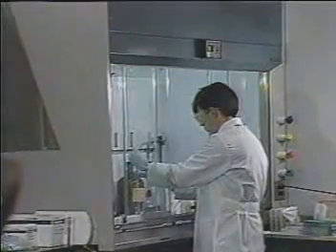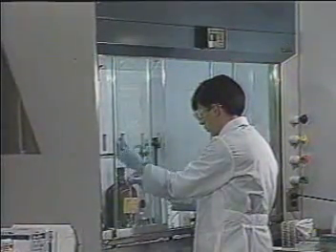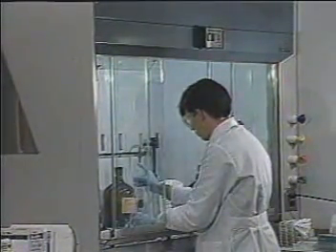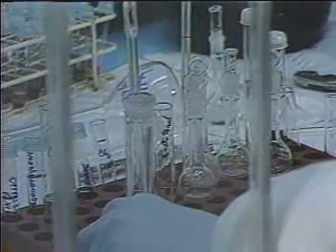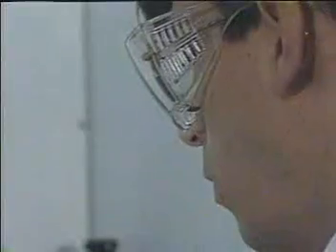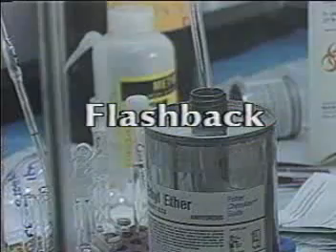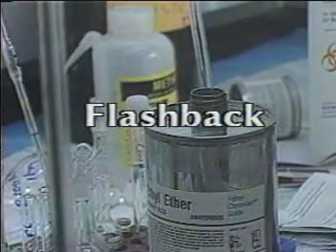Adequate ventilation must be provided to keep chemical vapor in the air from reaching lower flammable limits. Minimize all releases of vapor. Auxiliary ventilation is required when using some chemicals. Lab hoods help to confine and remove flammable and toxic vapors. Local ventilation control also helps prevent flashback, the accidental reverse flow of flame back to a container.